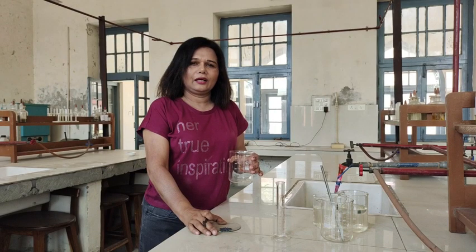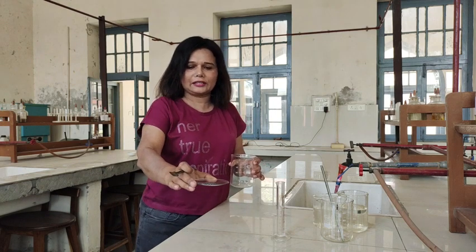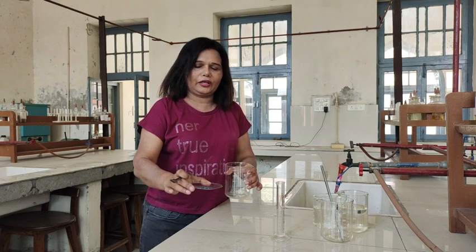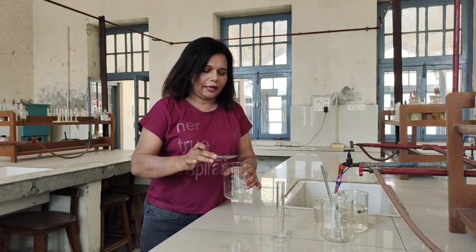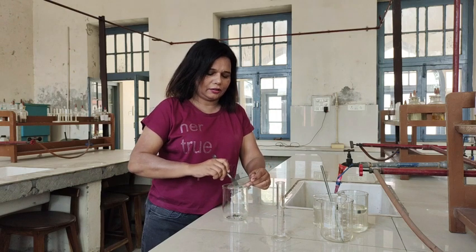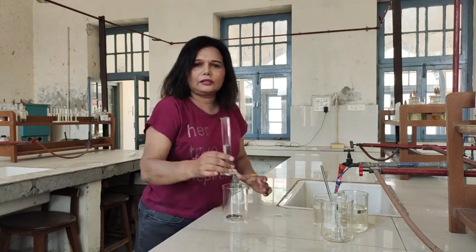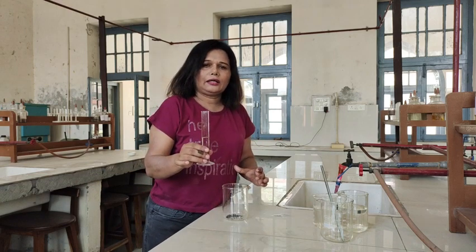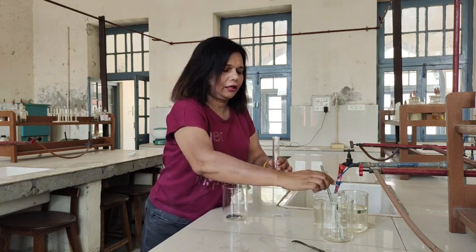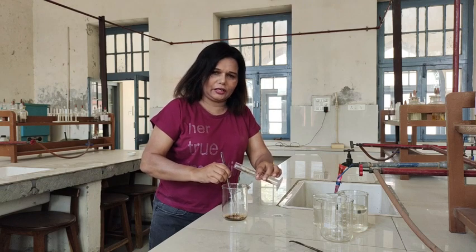Dear students, now we'll prepare iodoform in this lab. Here is iodine, 5 gram. Now we'll put this iodine in this beaker with the help of a spatula. After that, we'll add ethyl alcohol to it along with shaking with a glass rod, slowly and slowly.